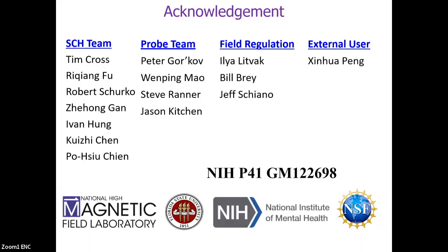Lovely talk. Really enjoyed that. About nearly 50 years ago, Tak Kuntz did some experiments on protein solutions. When he froze them, he saw there's a residual sharp water line with an area that's proportional to the protein concentration. And he interpreted that as indicative of a mobile interfacial layer, even in the frozen solution. So not totally bound to the protein and not bulk. My question is, can you freeze your bilayer samples and look for similar effects in the O17 spectrum?